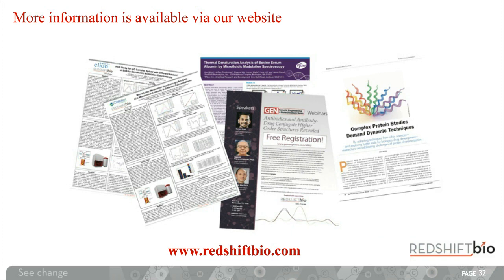I've used circular dichroism quite a lot myself, and it's very useful. It gives you really useful information on your samples. The way it works is it shines circularly polarized light at a sample, both right-handed and left-handed, and it looks at the differential absorption across the range. So very much like MMS works in one way.